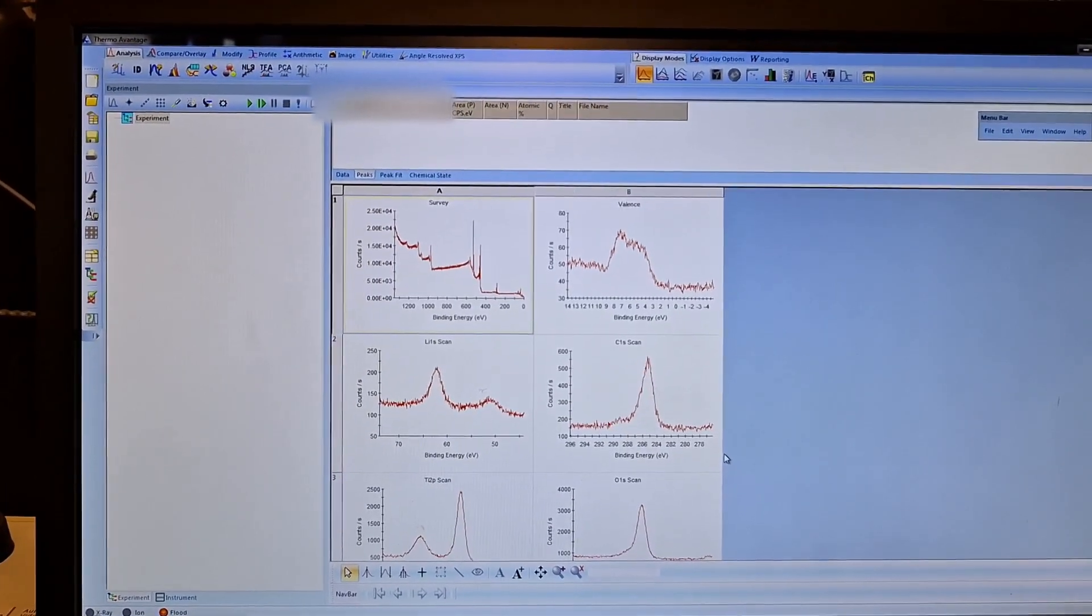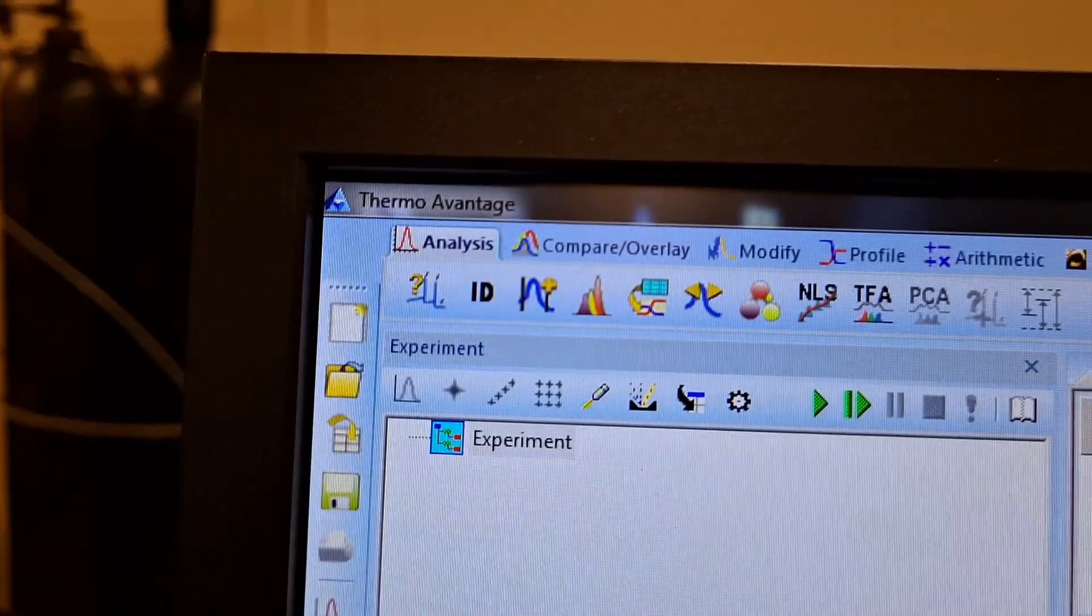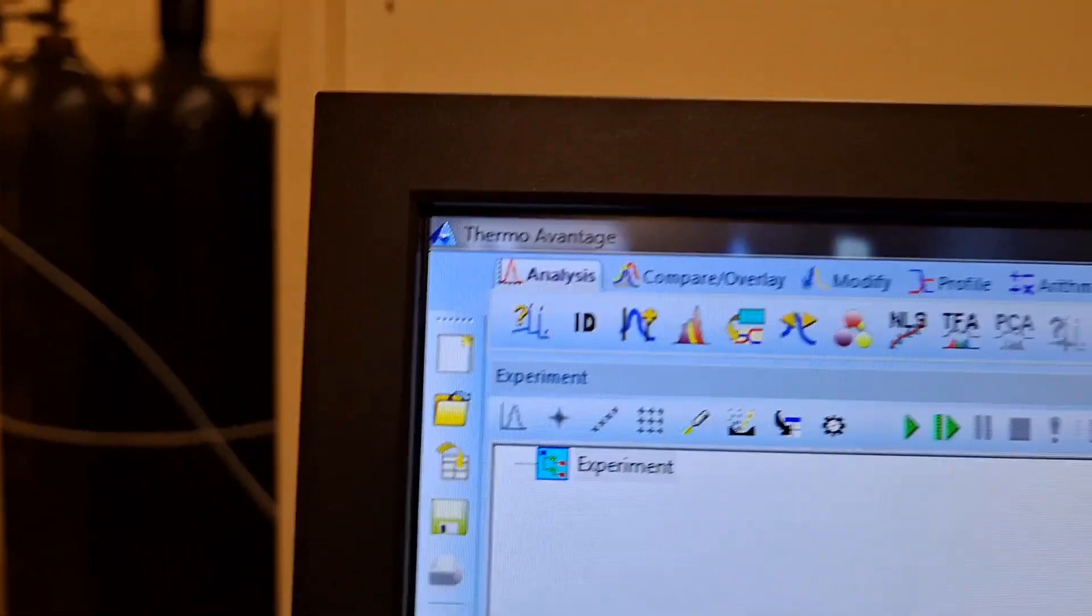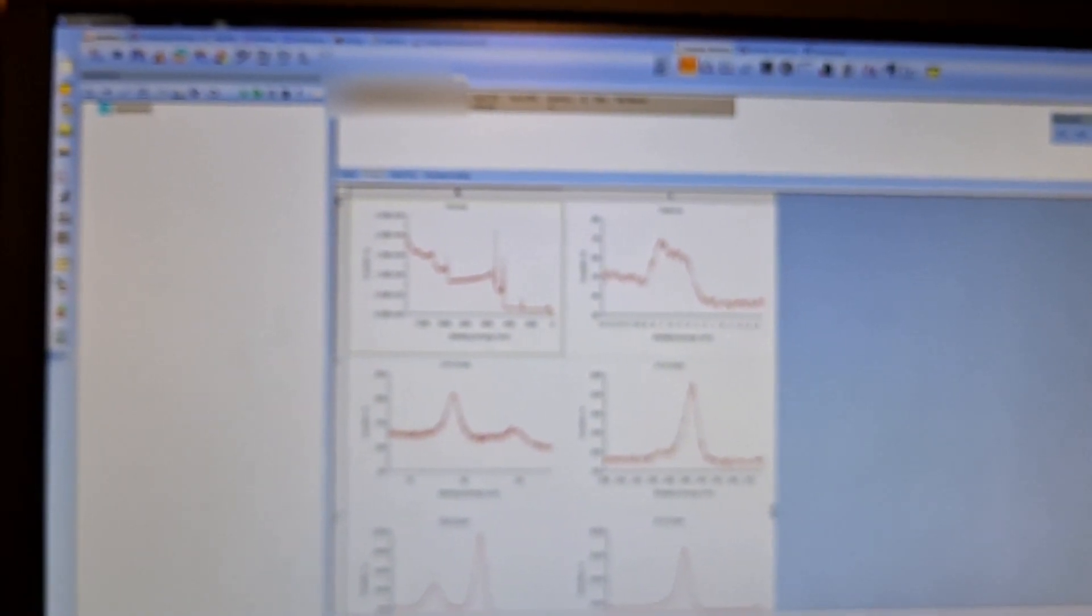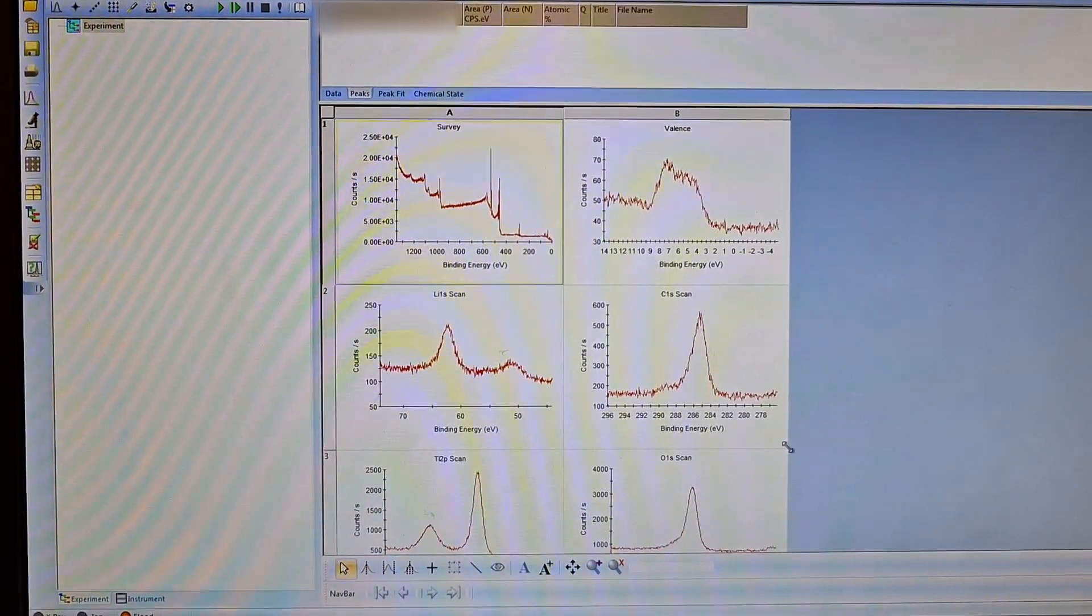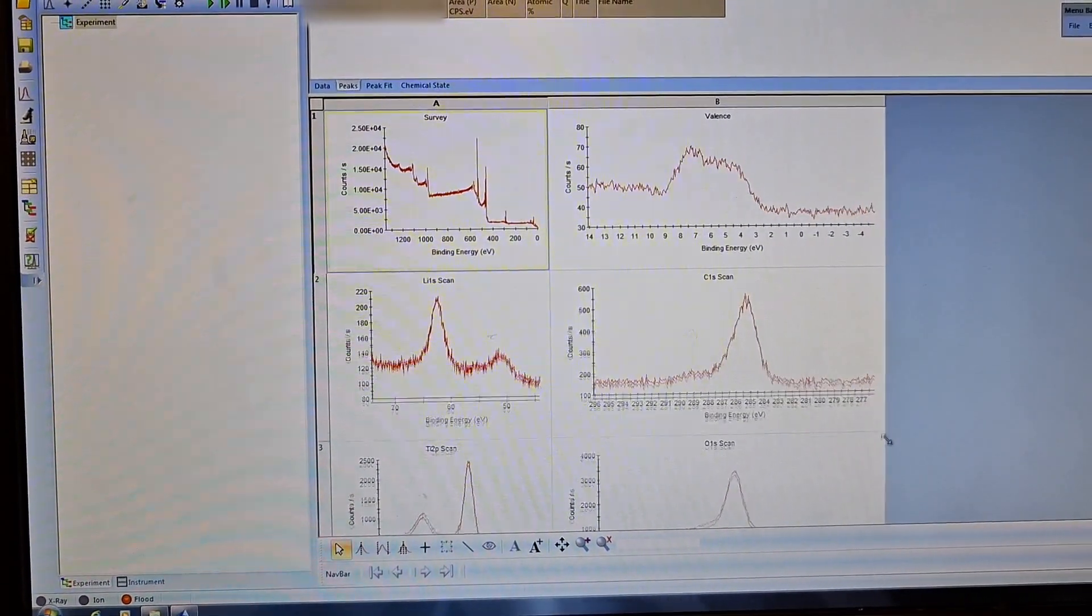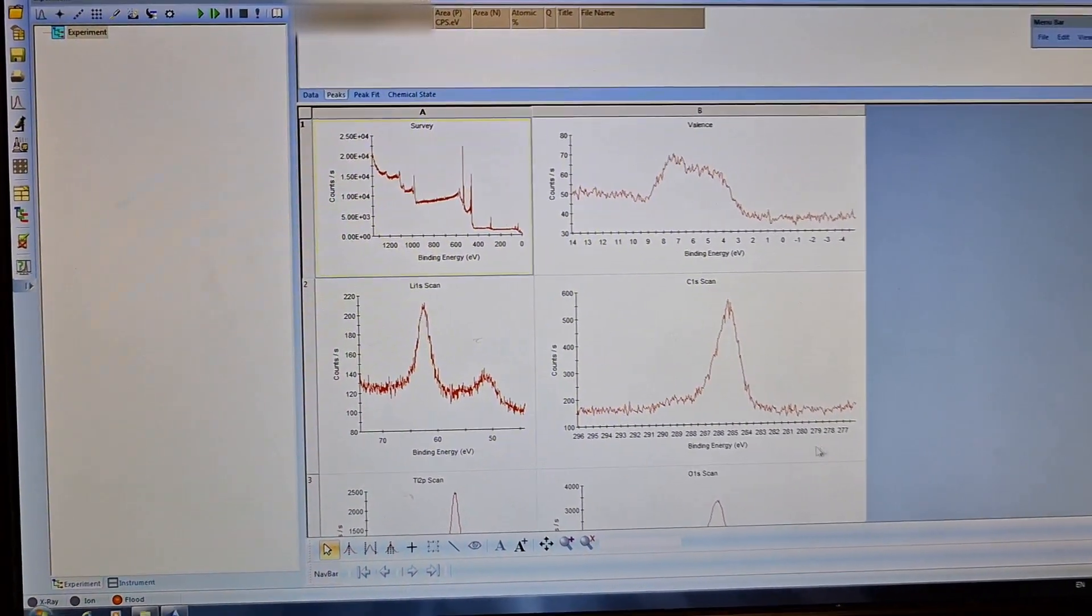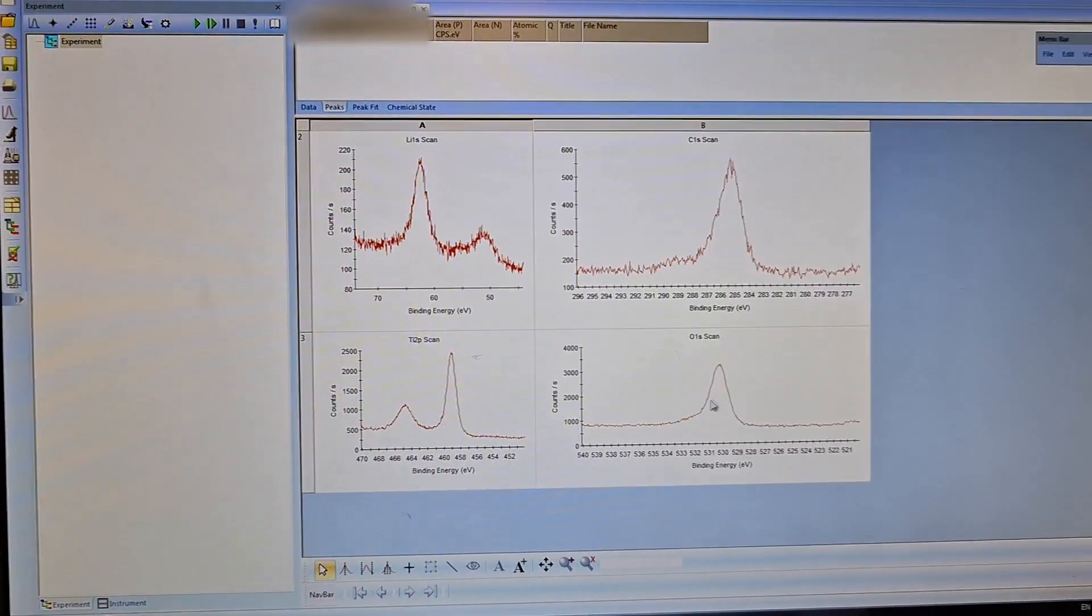This is the Thermo Avantage program. You can see these are the XPS data, and I will fit here for the oxygen. I will make fitting for the oxygen, one of the peaks.